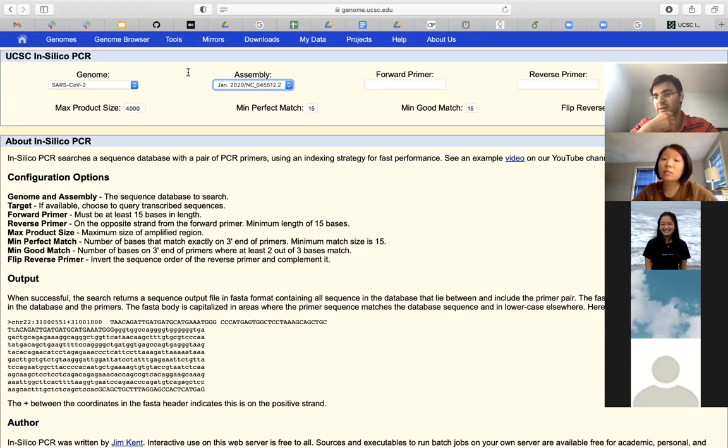You probably cannot do that using Illumina, but I am thinking that it's not a problem to do that using Nanopore, because Nanopore average length is in the thousands. It's probably 20,000, 30,000. Should not be a big deal for Nanopore. Okay, yeah, perfect. So the assembly is that information. This assembly is the FASTA sequence. So the one that I sent to your email today is this one.